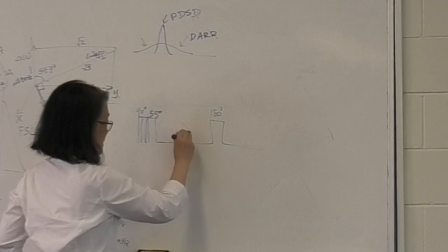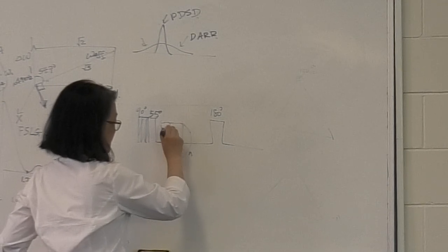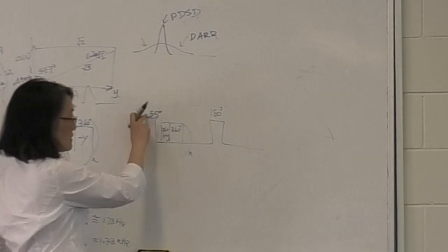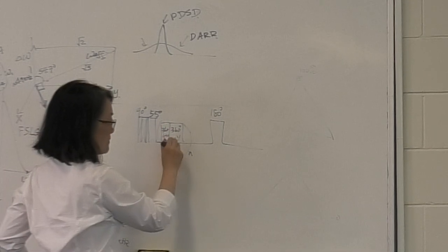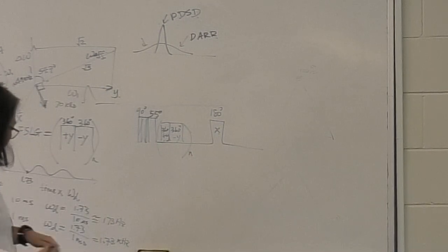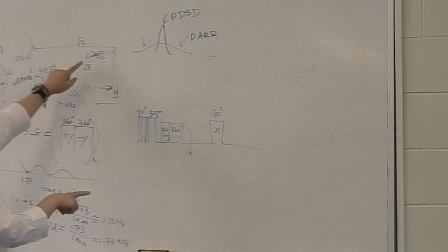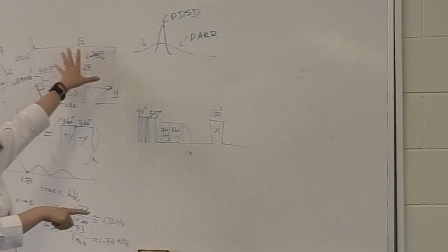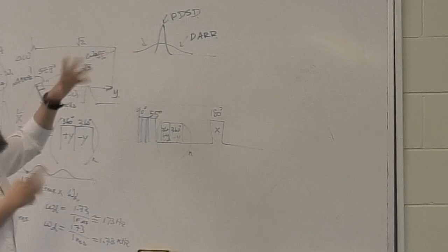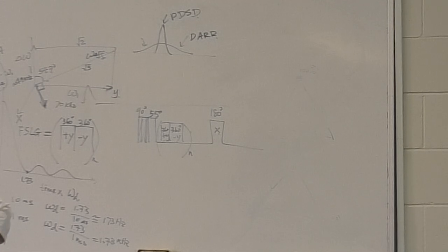This is basically 360. You have to work out the right phases for this. If this is plus y minus y, then this is going to be, I think, an x pulse. I think it needs to be perpendicular to the effective field direction, if the effective field is in the YZ plane. So it has to be carefully controlled for the phase of the pulse to work.